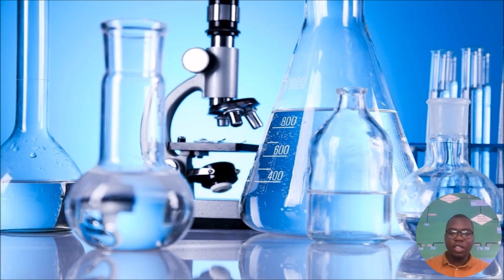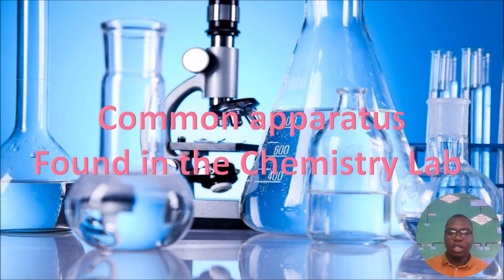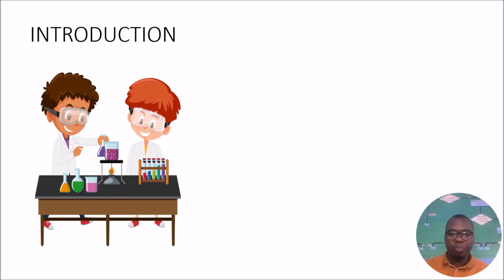Welcome to IGCSE chemistry lessons. In this video, we are looking at common apparatus found in the chemistry lab.